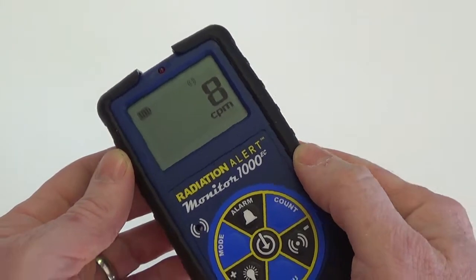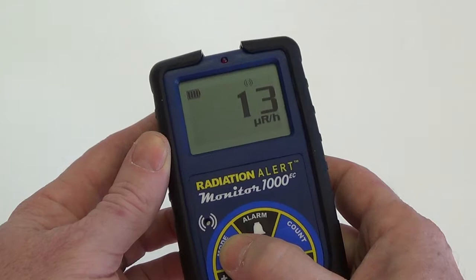Once the boot cycle has completed, you can use the mode buttons to scroll through the different units of measurement available.